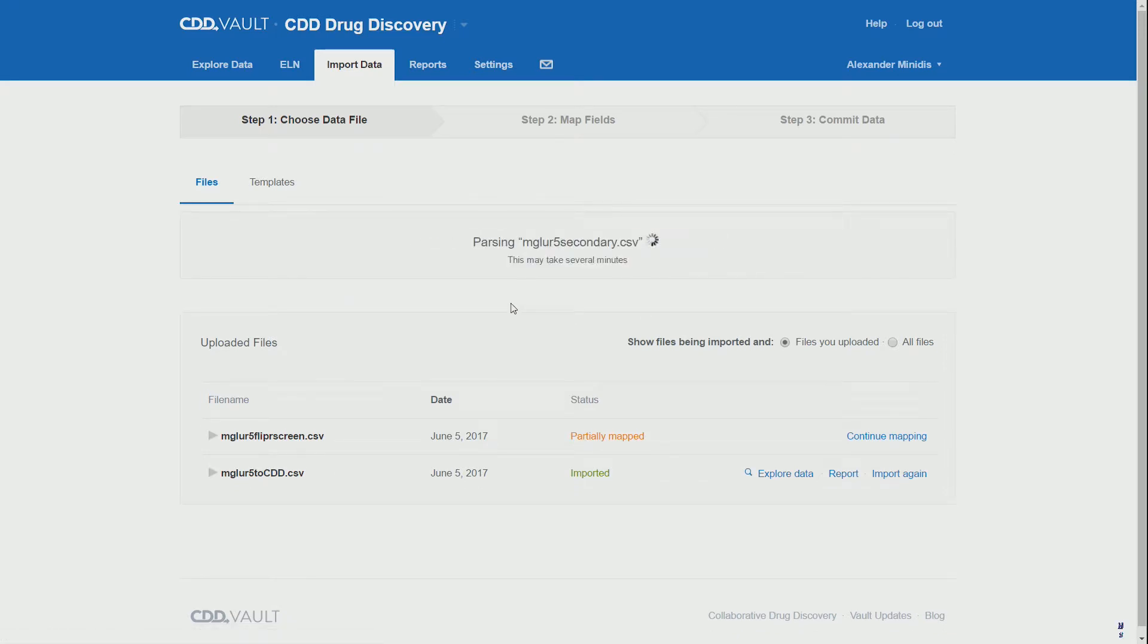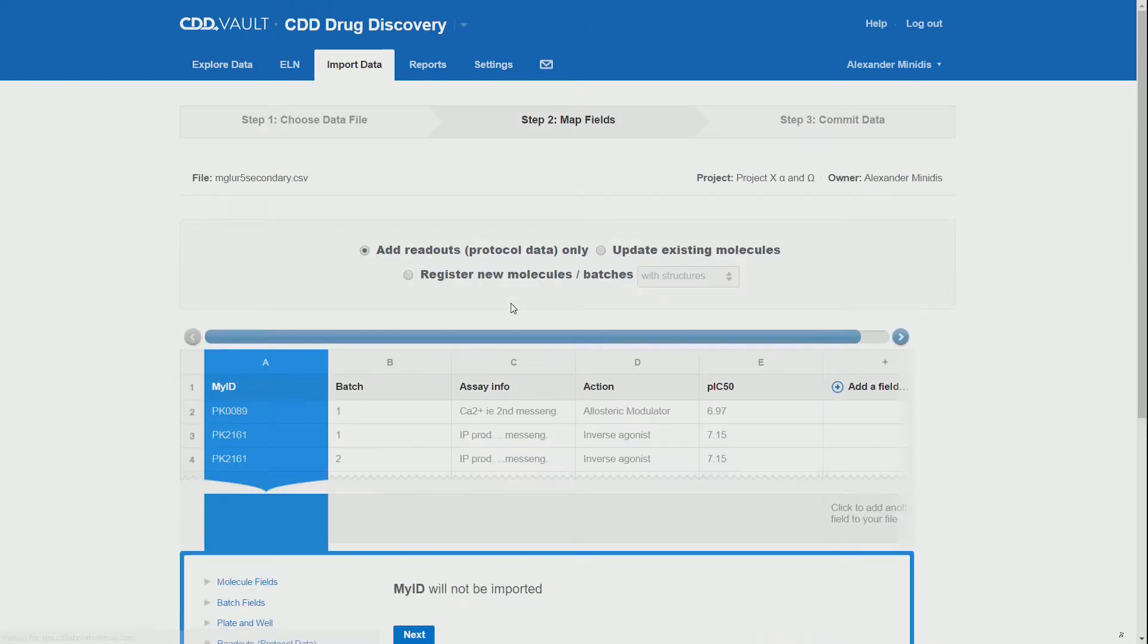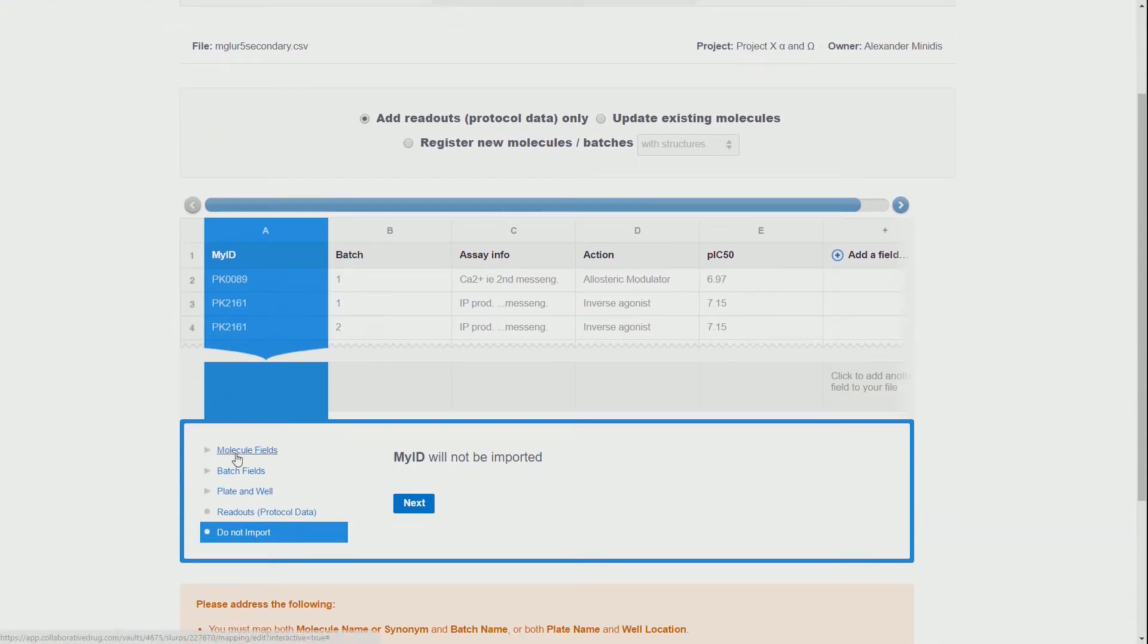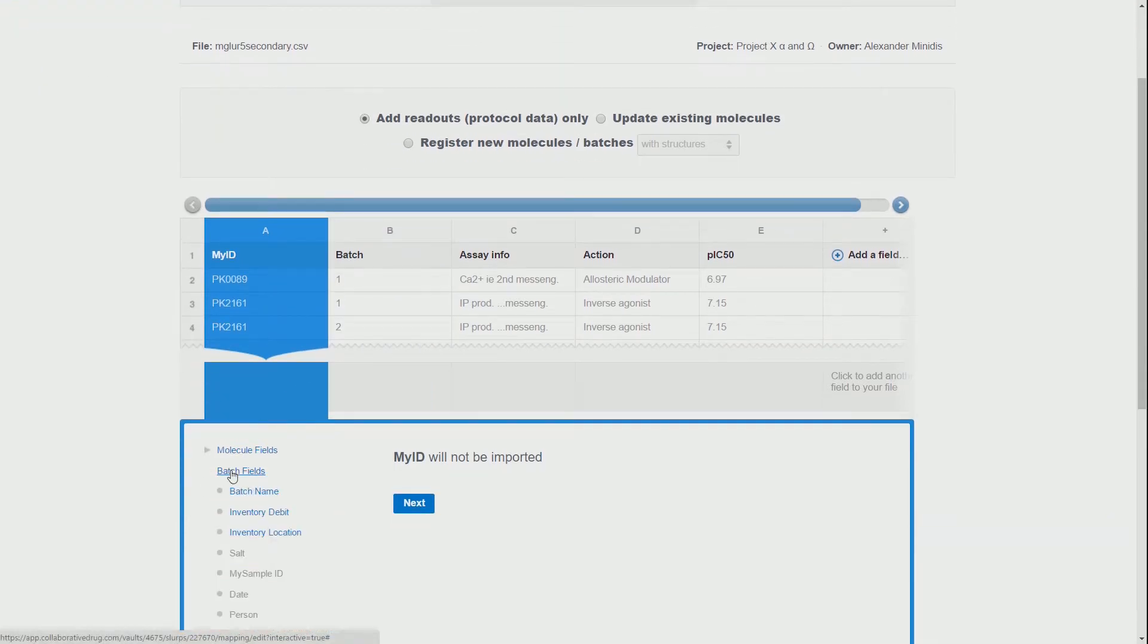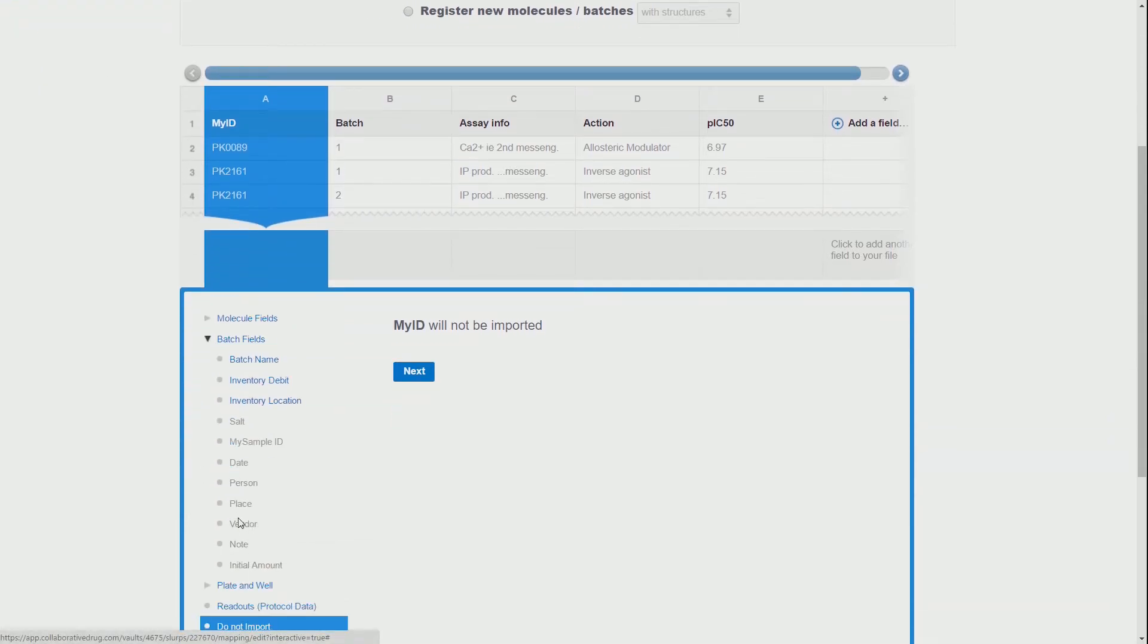We wait for this to import, and then we can assign our columns. But in this case we have to make sure that we are adding readouts and not registering new molecules.